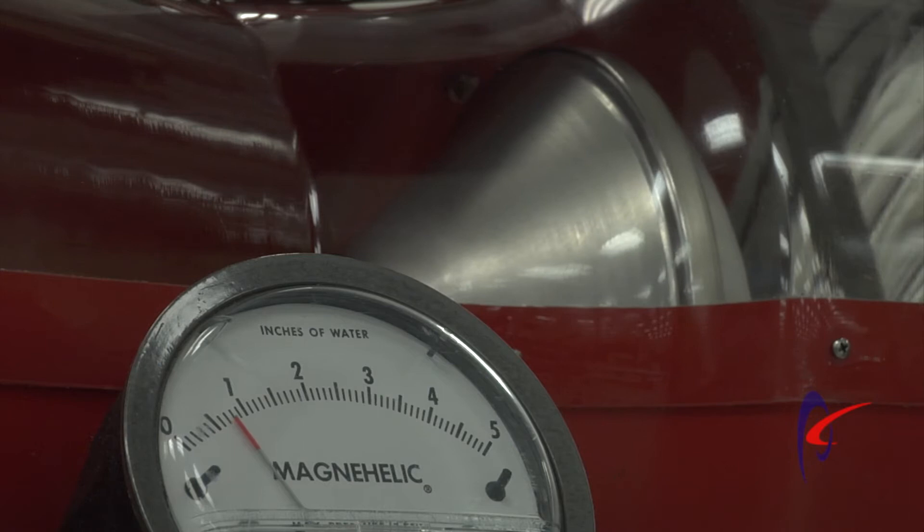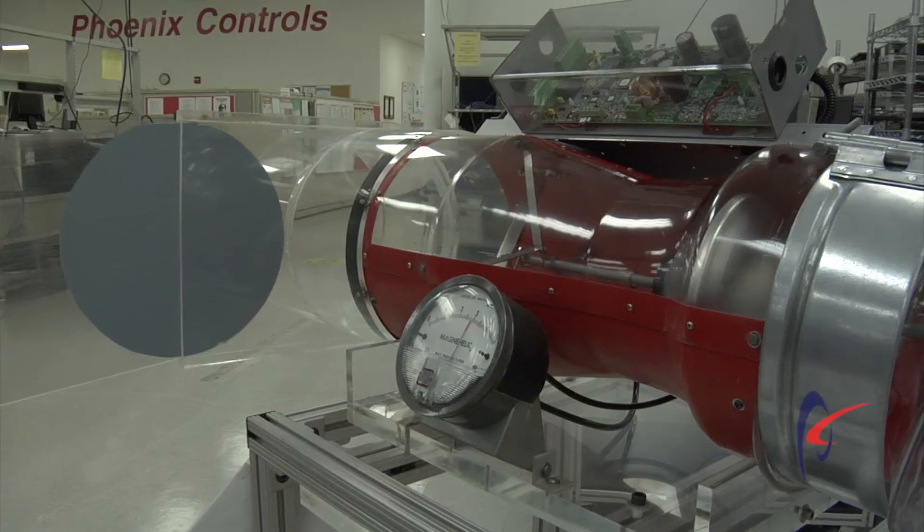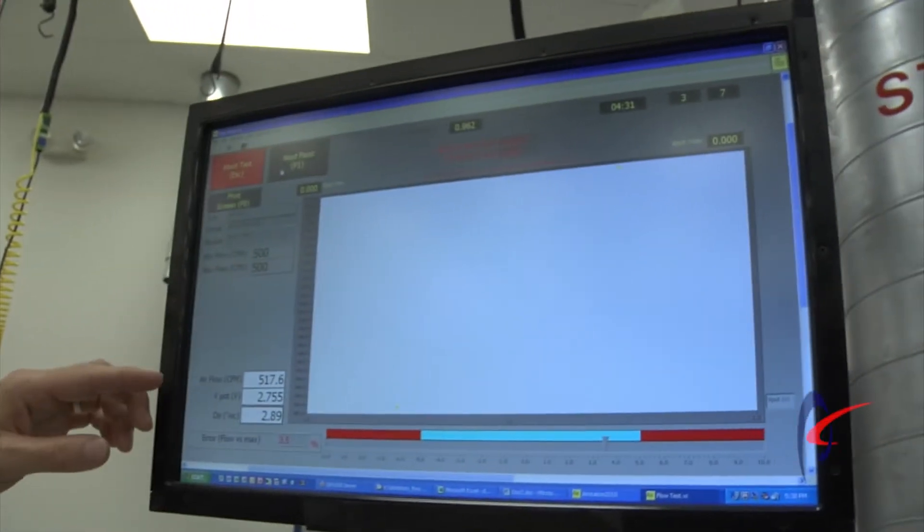We'll vary that pressure drop across the valve, showing the cone moving further inside the venturi, still maintaining constant flow through the device, plus or minus five percent. Then we'll ramp it all the way up to three inches pressure drop, our maximum on the Phoenix valve. The cone's further seated into the venturi, maintaining plus or minus five percent of the set point at all times.